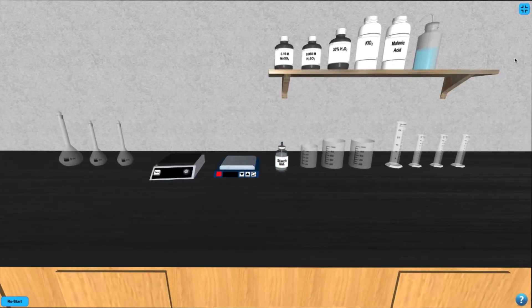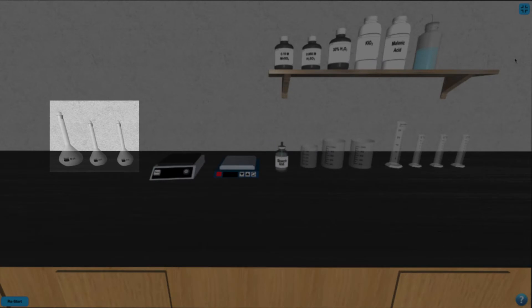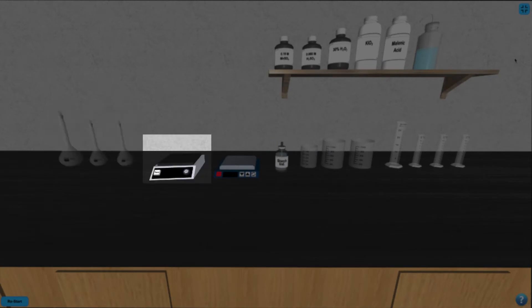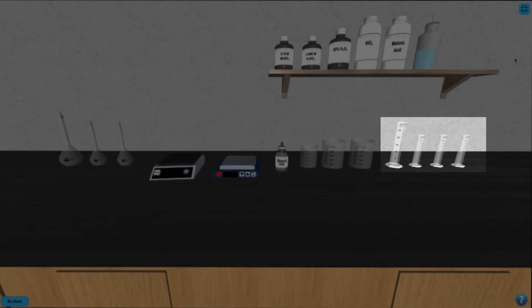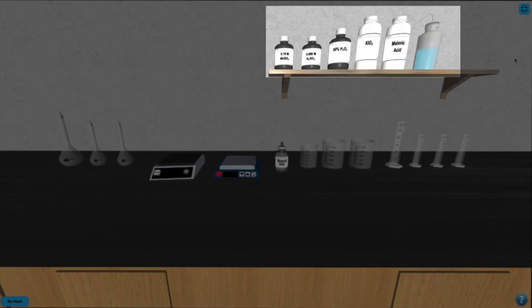In this simulation, we have a series of volumetric flasks, a balance, a hot plate, an indicator, a series of beakers and graduated cylinders, and a series of reagents to work with.